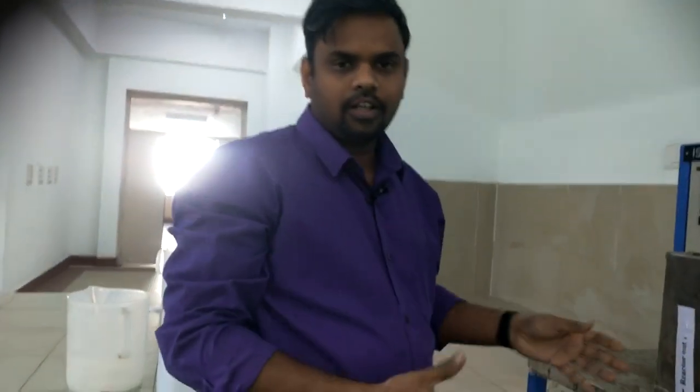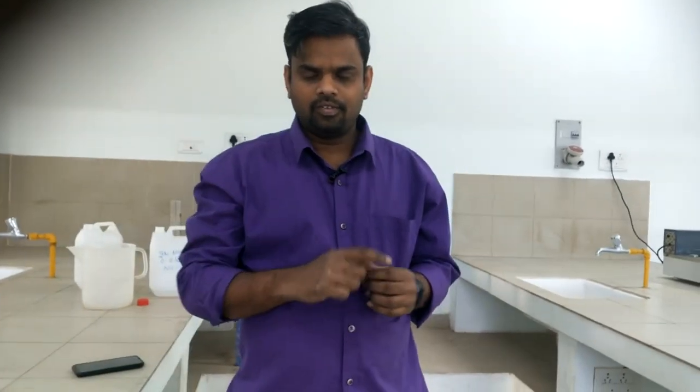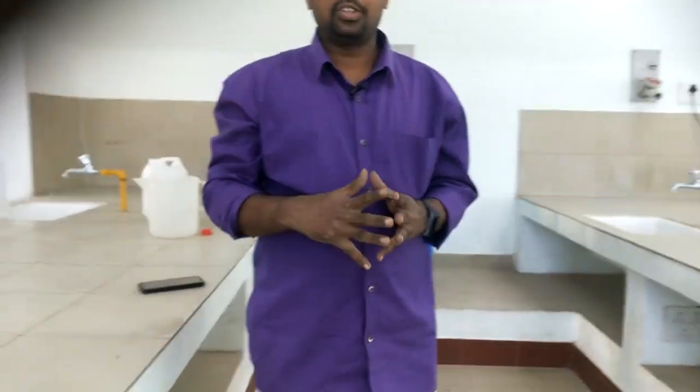Once we withdraw the 10 ml sample, we take 20 ml of HCl. In a conical flask, we take 20 ml of hydrochloric acid and add 2 drops of indicator. Then we add the withdrawn 10 ml reaction mixture into it and immediately titrate it against NaOH solution. The titration procedure is the same.